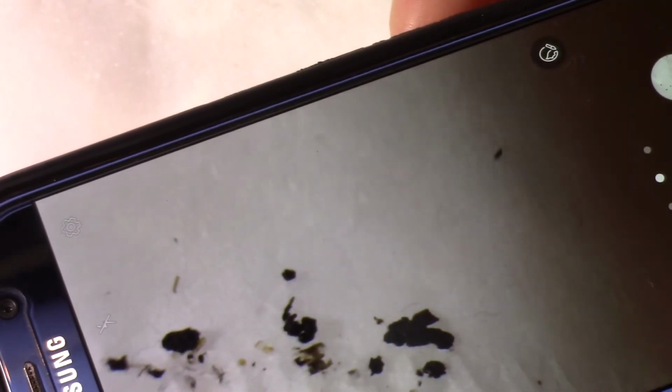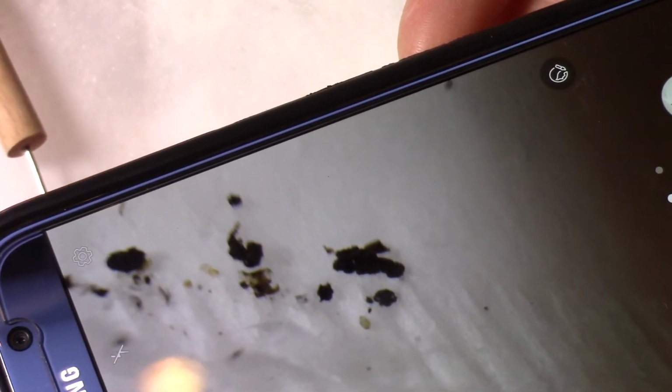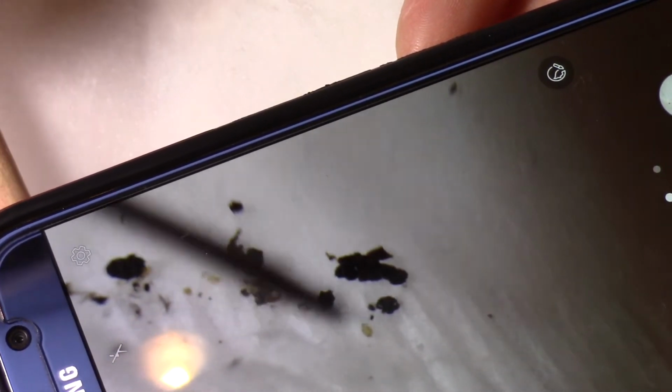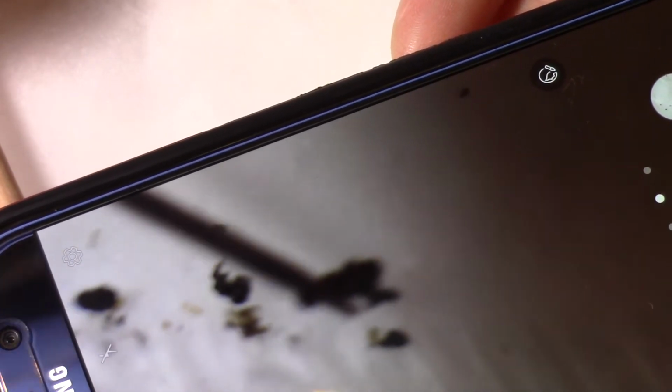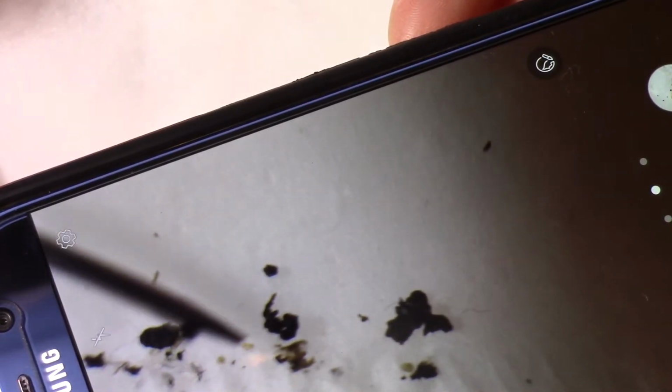If you guys can't see everything, I'm trying to look at the screen and look at what's on the video as well. It's not easy keeping all of this on the video. But I'm going to see if I can focus in on that, maybe a mite. It looks like there's some maybe mites. Where's my, right there. Definitely doesn't look like dirt, but it's too small for this particular microscope, and those ones there look like maybe mites.